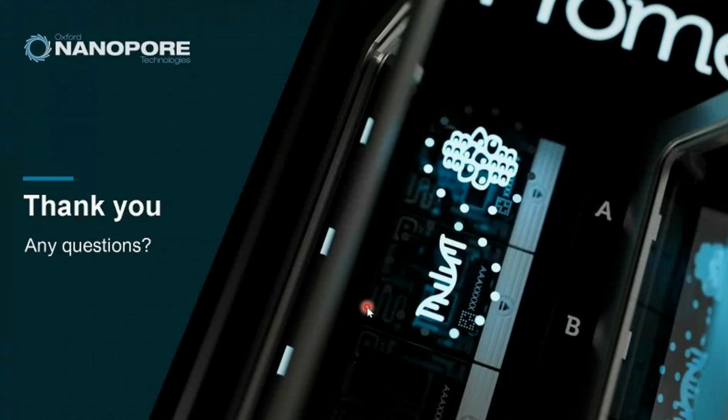For the sequencing, we do not have a very special kit for this particular application, but the challenging part will perhaps be the extraction step. We need to be able to recover the microbes or DNA after extraction, and if we are able to get the DNA, then we are able to sequence it.